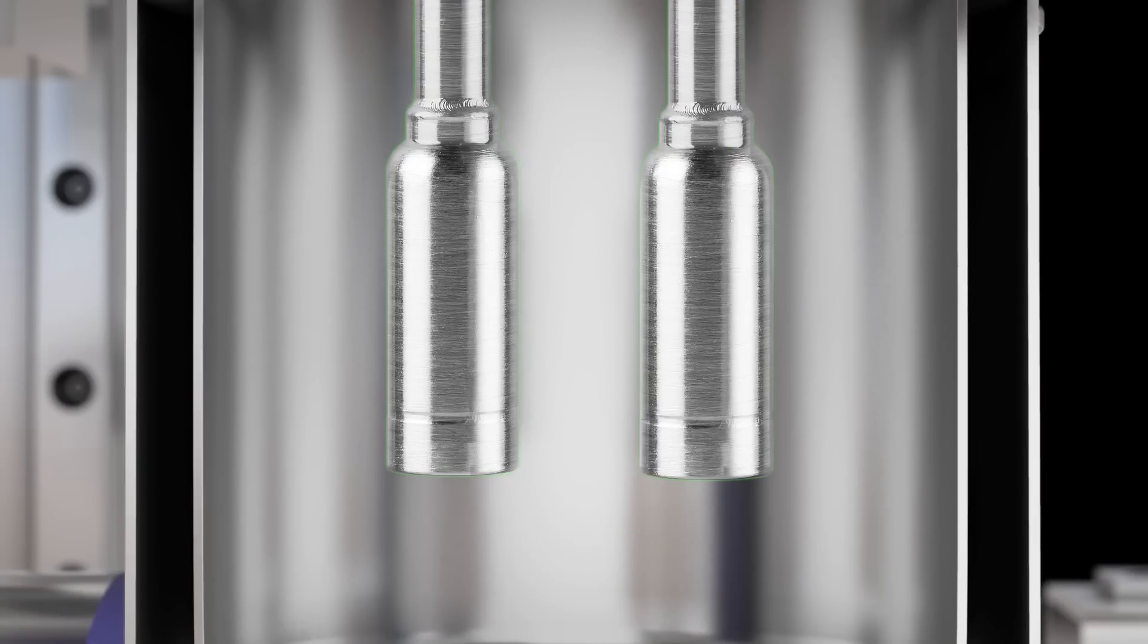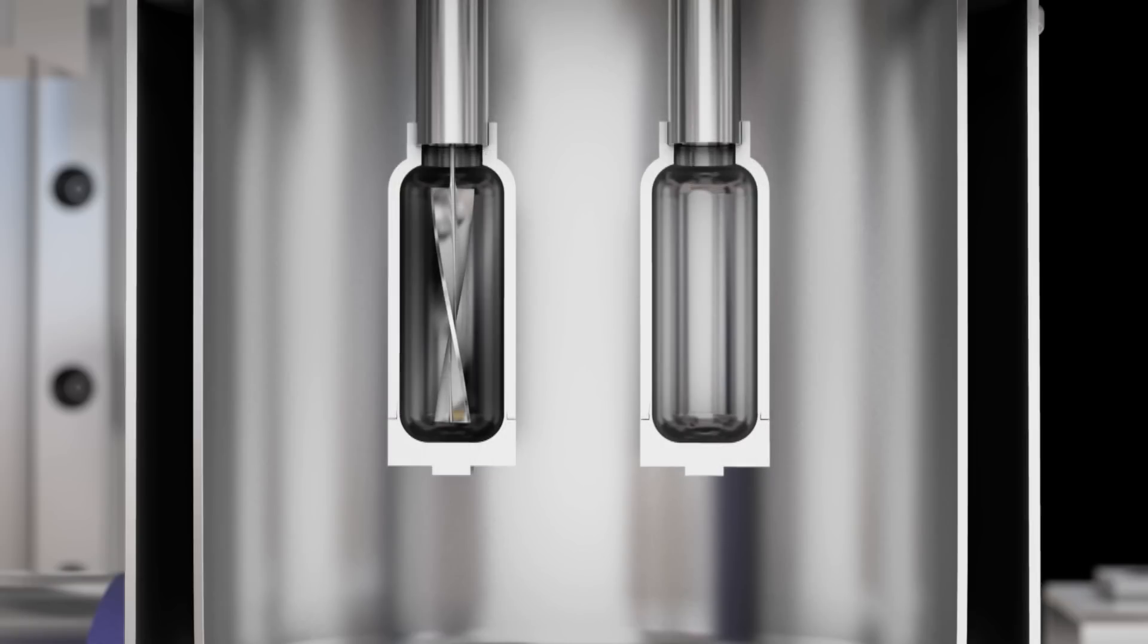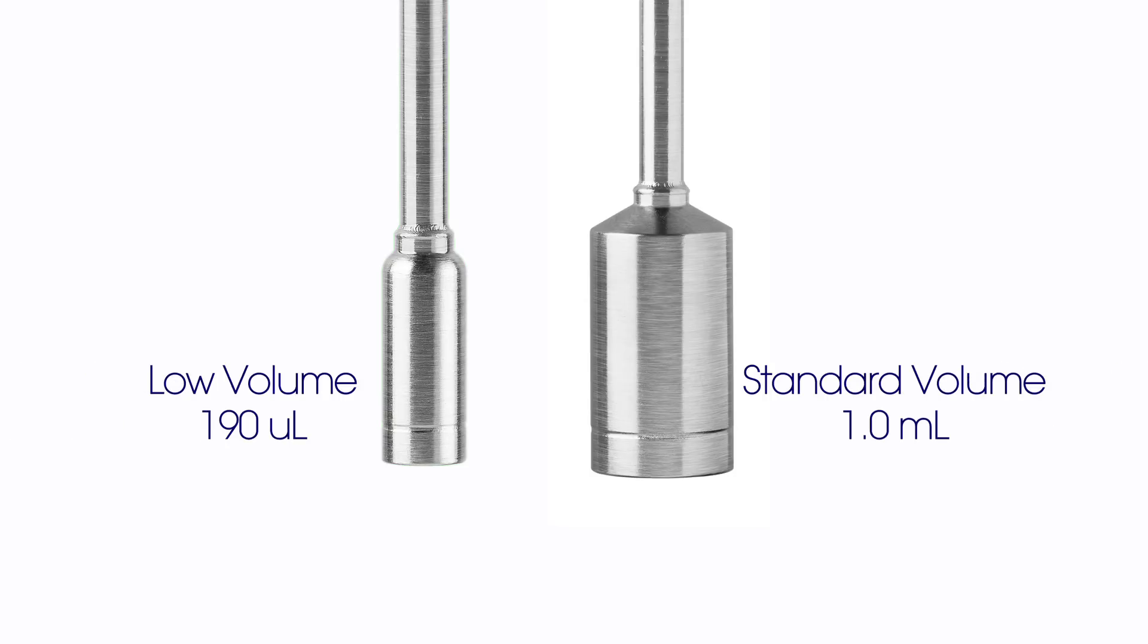The cylindrical cell of the Affinity ITC is chemically inert and provides optimal enthalpy measurement with the most advanced active heating and cooling temperature control in both standard and low-volume cells.